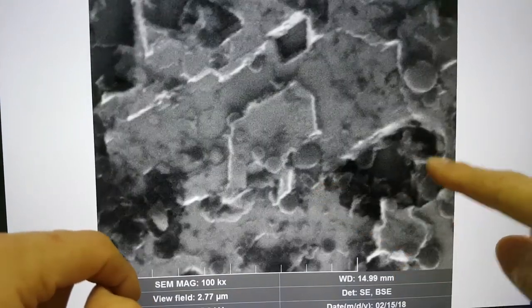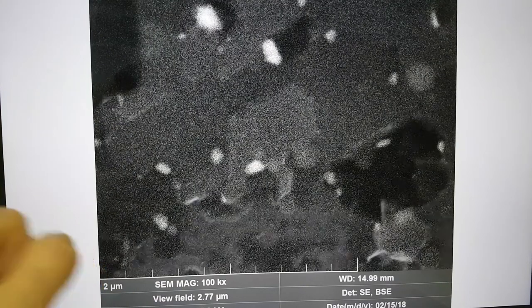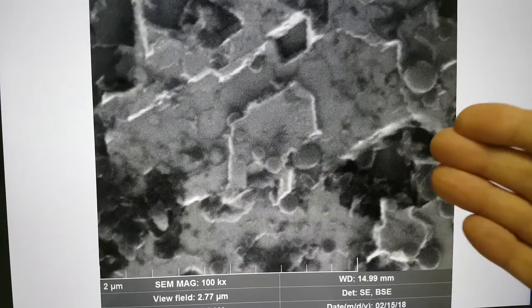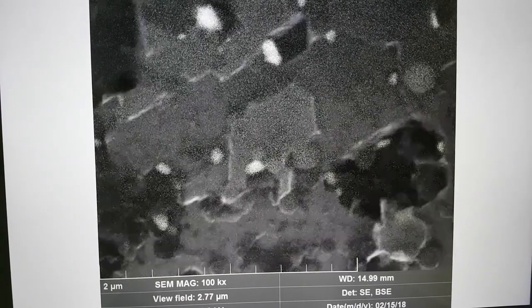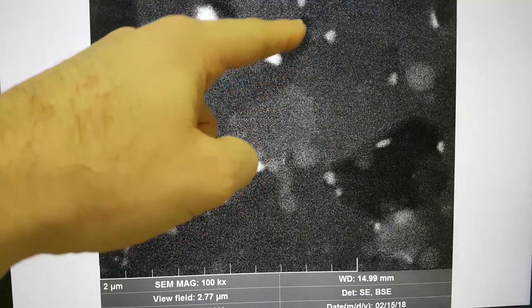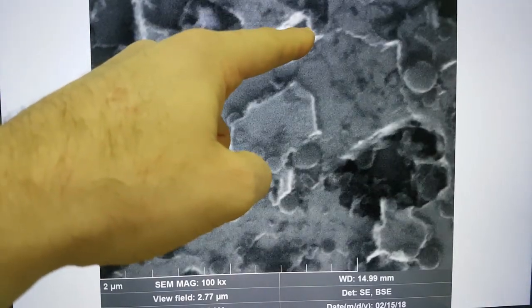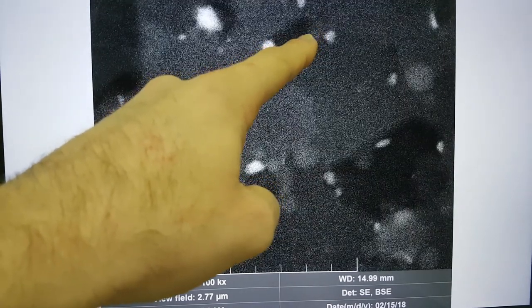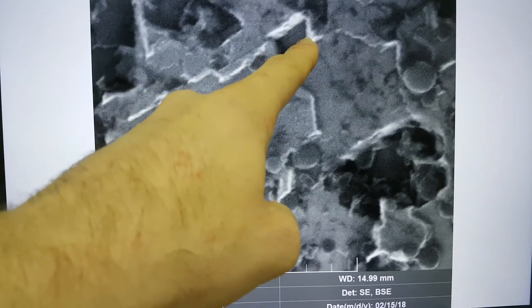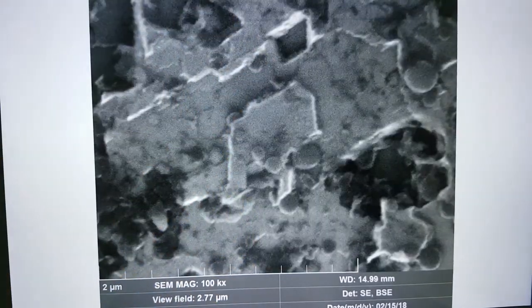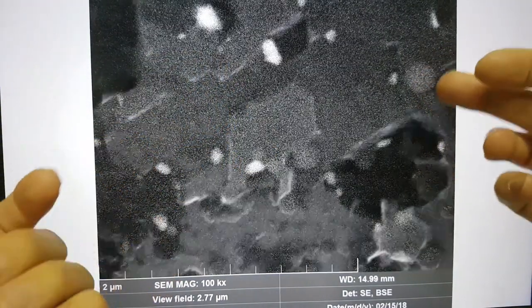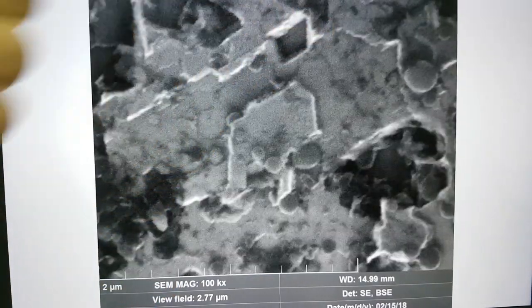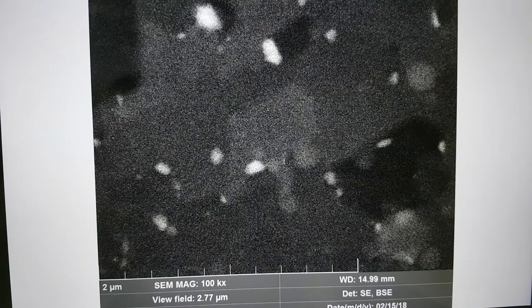They're not even going in the same direction, they're going in different directions. This one's over in this corner, this corner, this corner. It's absolutely fascinating to me. I really would like some other explanations other than what appears to me to be happening. That something has gone onto the diamond surface or been created within the diamond, and it's found a weak point and started chewing away at the material.